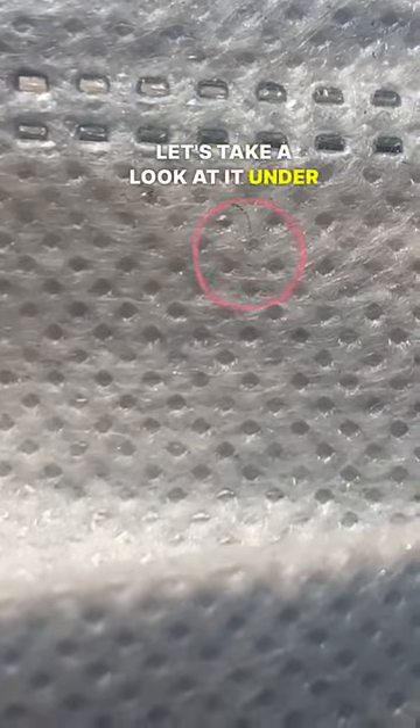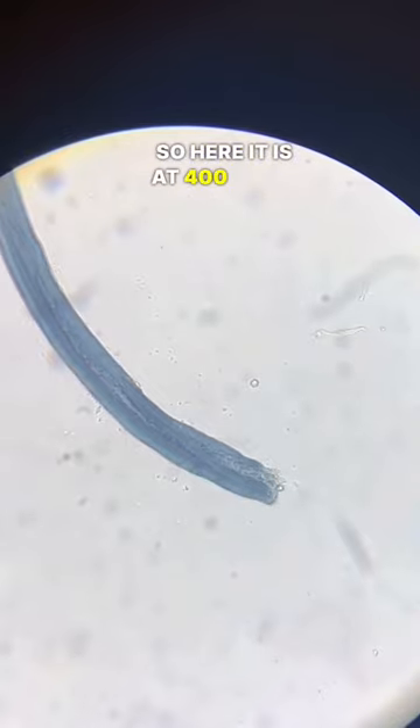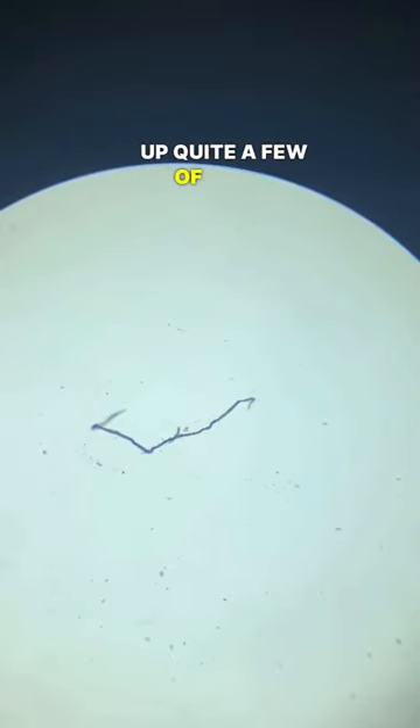Now let's take a look at it under the microscope. Here it is at 400x magnification. It's obviously not alive, it's just a little microscopic fiber. These are actually everywhere — even just rubbing it on my shirt, you'll be able to see that I picked up quite a few of them.